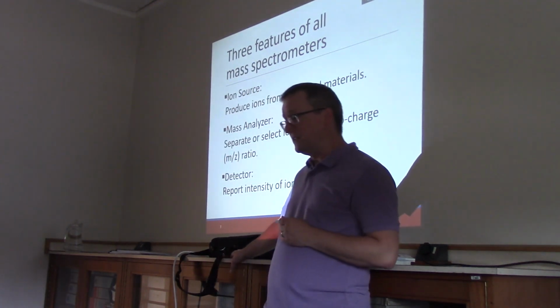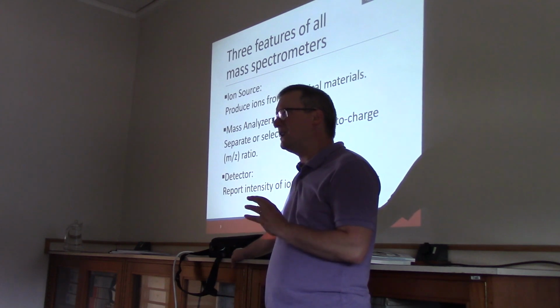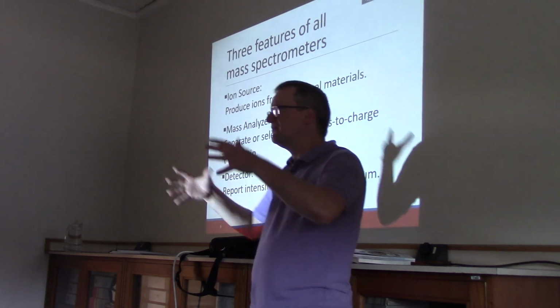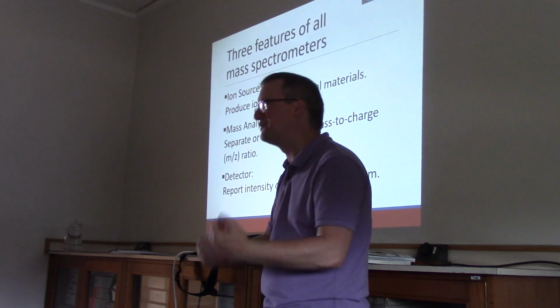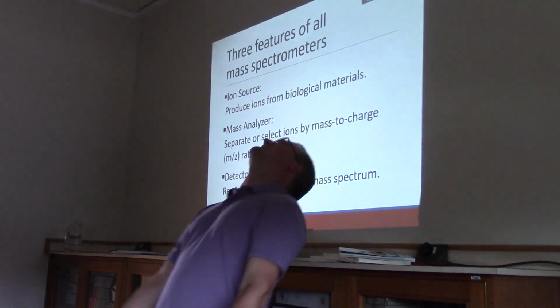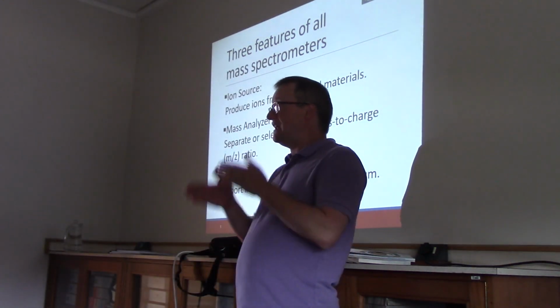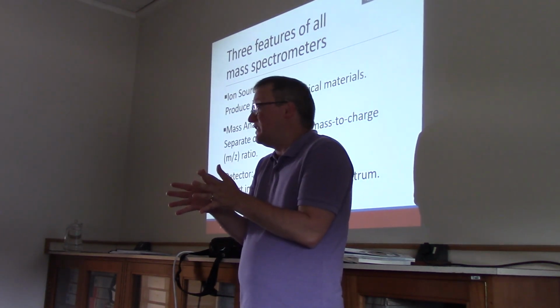I really feel like this topic deserves a lecture all to itself. But I'm going to try to give you some of the basics to begin with. Do people remember the old tube TVs? Not like the flat panel ones, but like the ones with some depth and heft to them, right? You know, in the old days, if you were going to move your 30-inch TV, you brought in a buddy, right? Right? So one of the reasons those things are big is that they use magnetic fields to steer electrons, right?